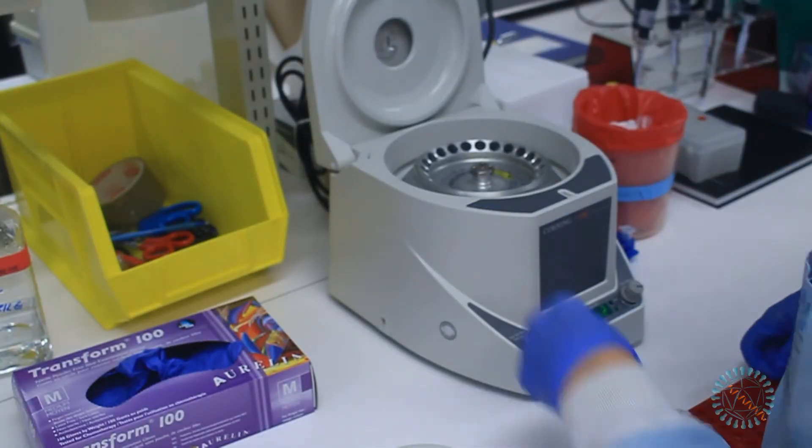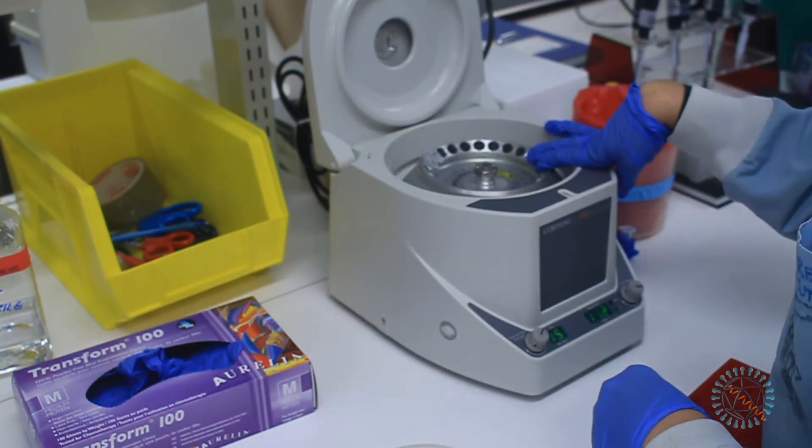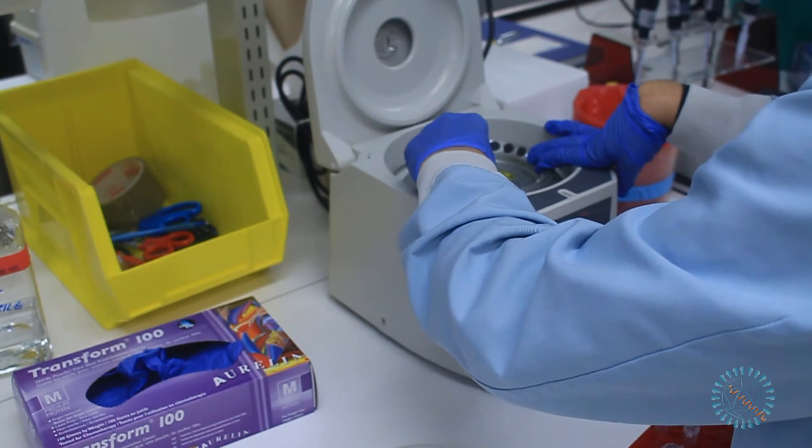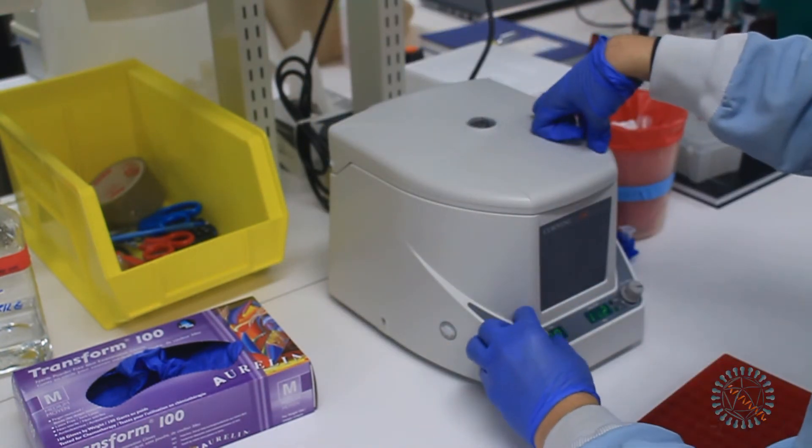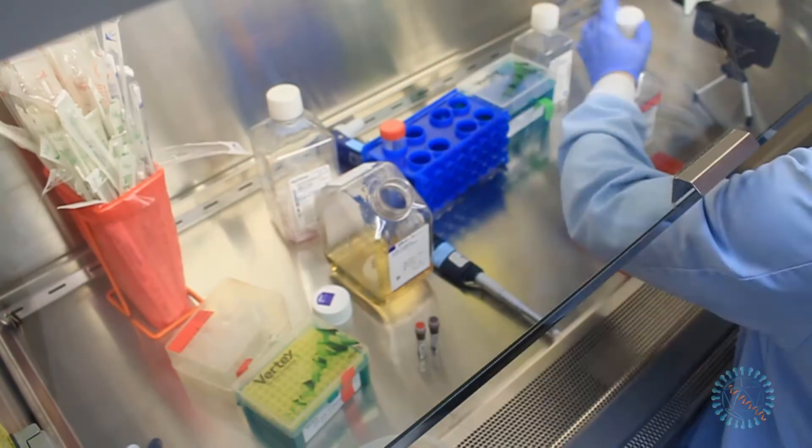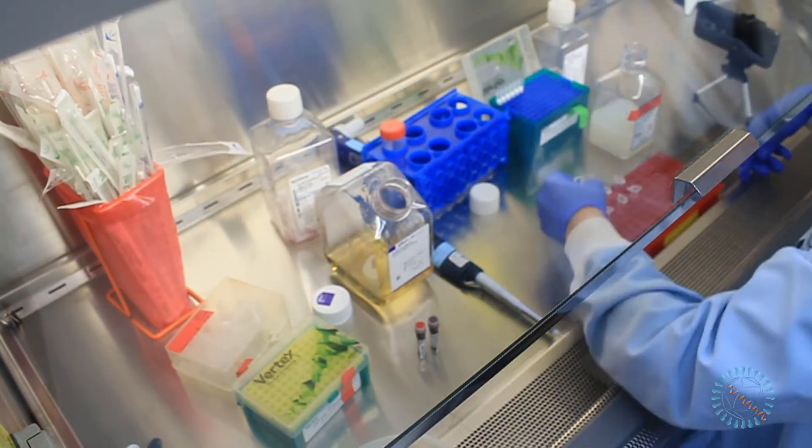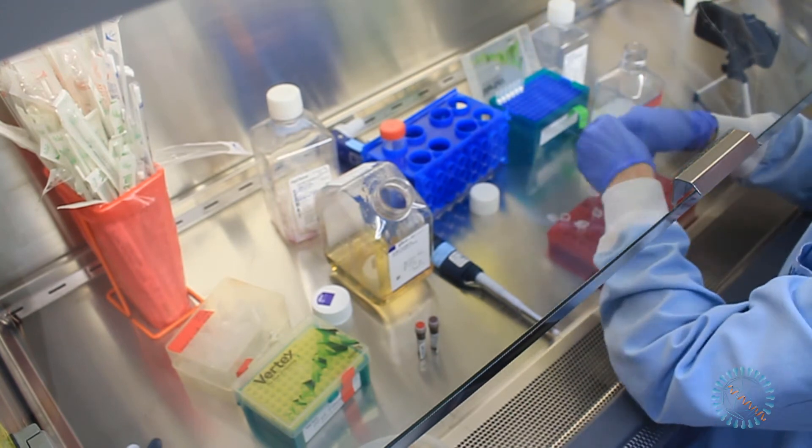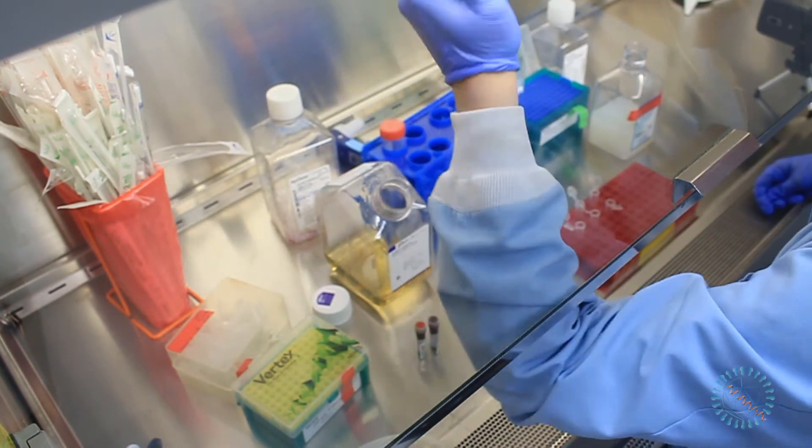We will now proceed to pellet down our cells using a microcentrifuge, so that we can then remove the old media and wash the cells. The centrifugal force will depend on the type of cells and the experiment. In this case, I will use 200g's for 5 minutes. After recovering the tubes from the centrifuge, I will discard the old media in the waste container and then proceed to wash the pellet of the cells using fresh media.